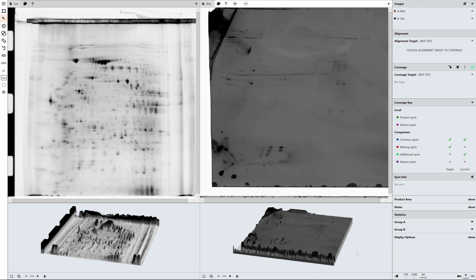Hello everyone. So today I'm going to be guiding you through how we achieve reproducible HCP coverage using 2D techniques by using our SpotMap 2D software. Now, one of the very common complaints, outside of the difficulty of the manual handling of this technique, is difficulty in data analysis and being able to get reliable inter-operator, inter-site coverage scores for different antibodies.